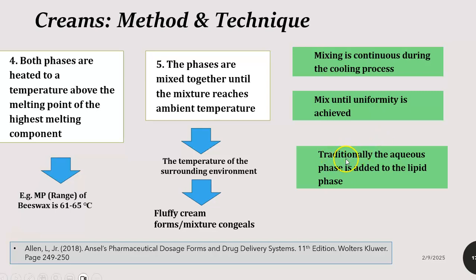And importantly, traditionally, the water phase is what we would heat and add to the lipid or oil phase that would have been melted and also at the same temperature. But in my reading, either way, the cream will be formed.